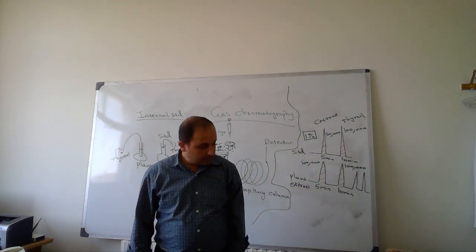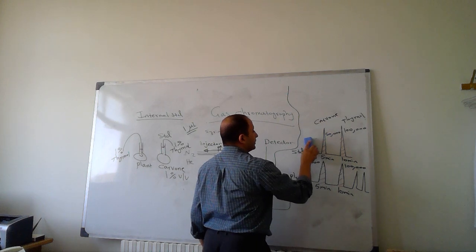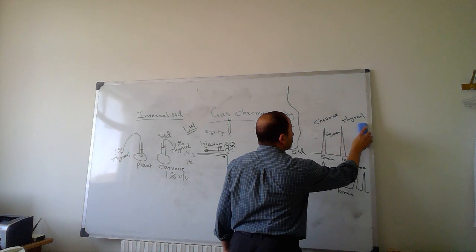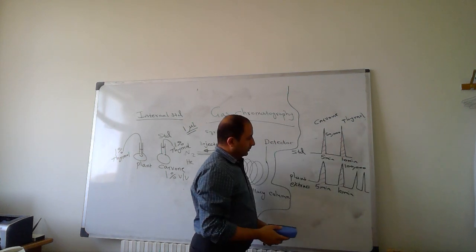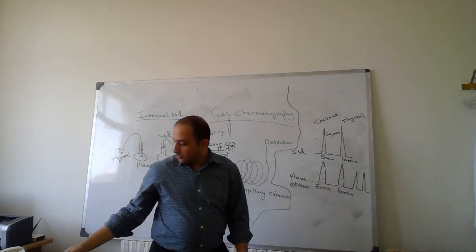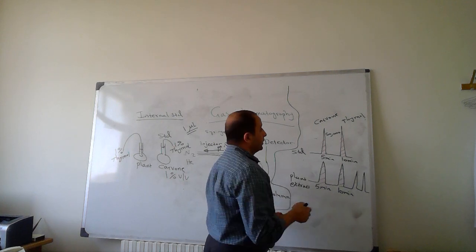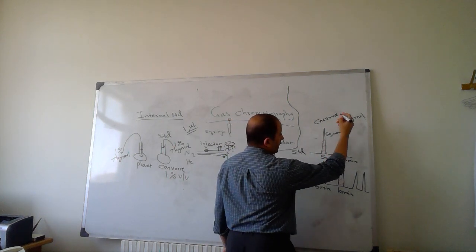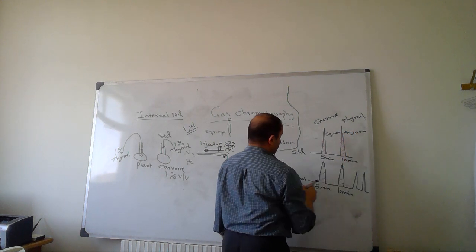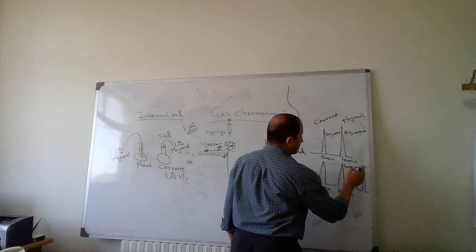Okay. Let's take another scenario. In the standard material, we assume that thymol is 50,000 when the plant extract is 100,000 for thymol.